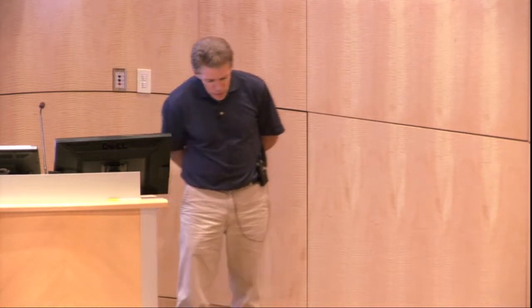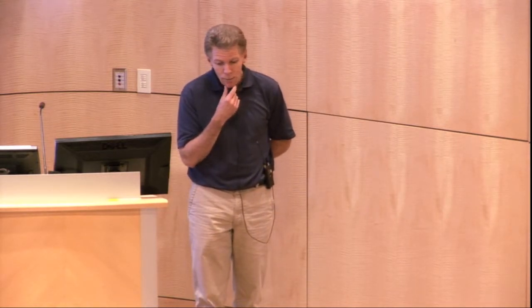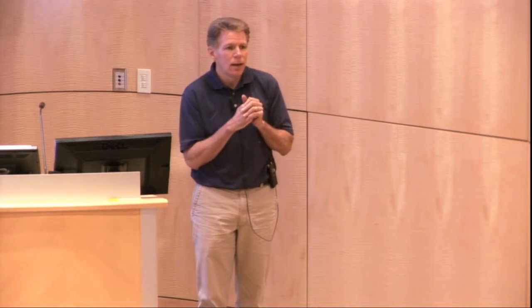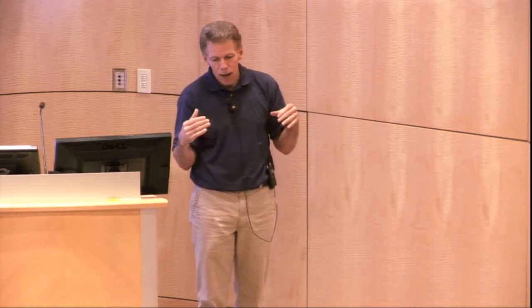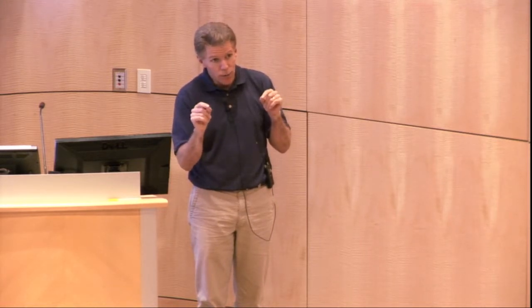Yeah, we looked a little bit at exome data in collaboration with Menachem, actually, when he was working on XHMM. Menachem's going to talk about this a lot more. There are a couple of problems. One of the main problems is that the capture process itself introduces a lot of bias in read depth. You'll have very different read depth across the different capture targets. There's a lot of different efficiency in the capture. So you have to have some way to normalize that read depth.